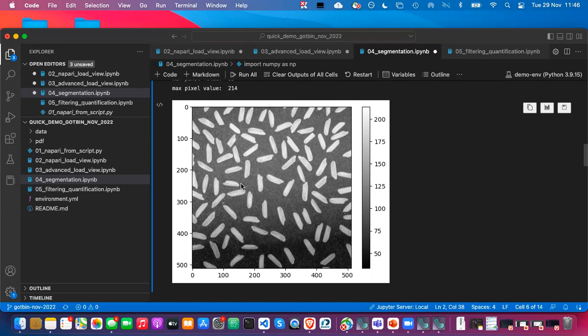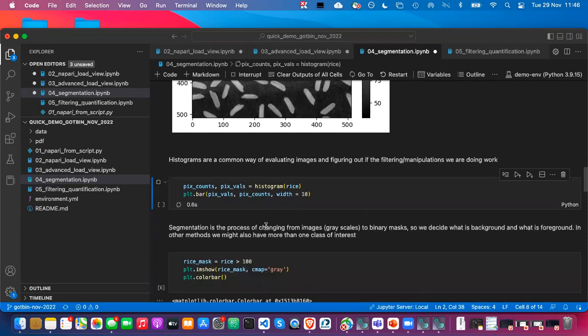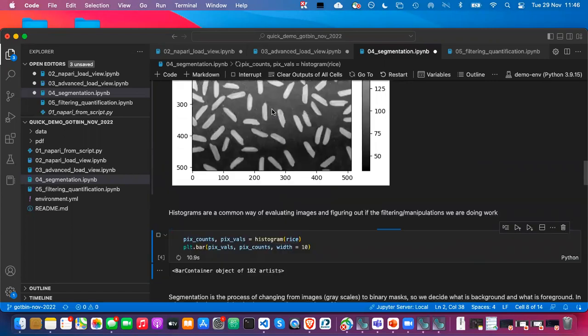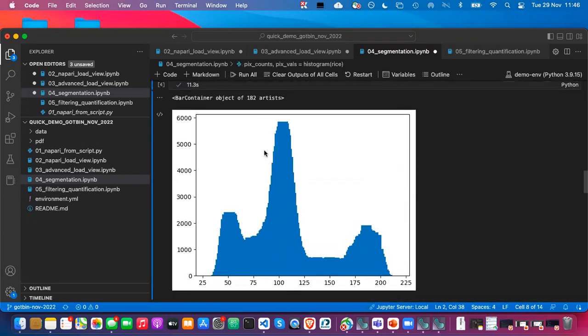So first, I'm going to show you what classical thresholding is. Classical thresholding is basically based on the analysis of the image histogram. All the algorithms are going to initially build a histogram of all the counts that are available in that particular image. So then what you see here is that in the ideal image, we should just have two populations, right? Background and objects. Right now, it's a little bit more complex than that.